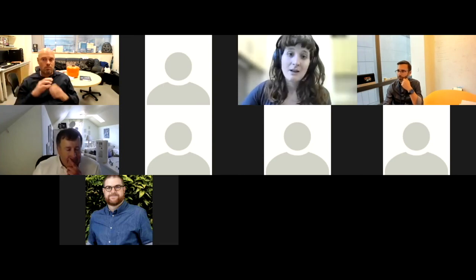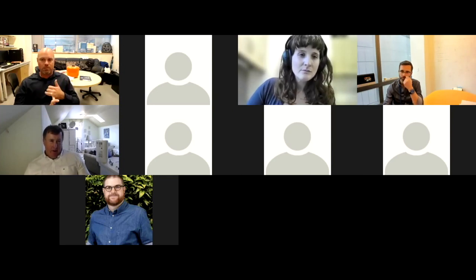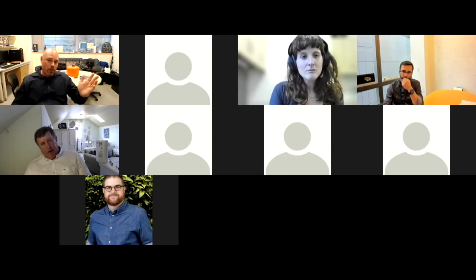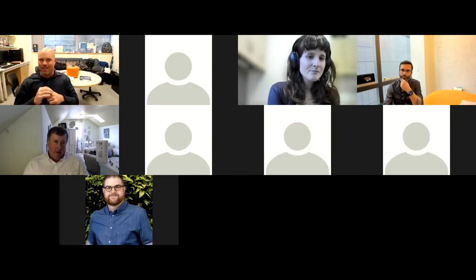Yeah, it would just be wizard based, right? You just have a wizard, and I would think the only things you could actually really affect would be suggestions, right? Because manually you have to change tips, nozzle sizes. I guess it could be pressure changes, because even on certain ones, there's a recommendation: you've got a 70 micron tip, use 60 PSI. But we find that certain things, if you drop it down to 50, you can still get great breakoffs and your streams get a little tighter to the sides and all this other fun stuff. But I think it's limited in what it actually does, because it says you can pick fragile or whatever, but you kind of do that anyways. You're not going to take a fragile cell and just run it at 30, 40,000 events per second.